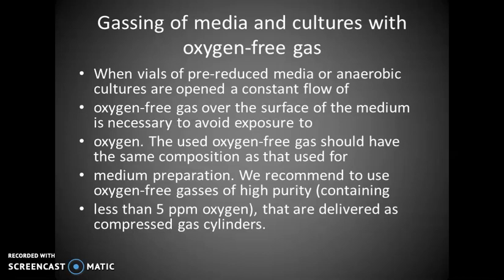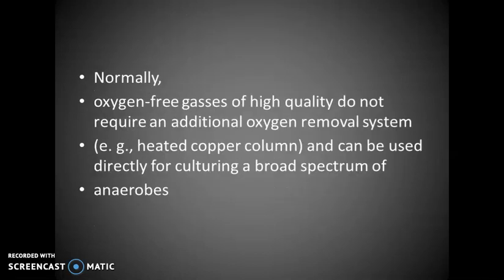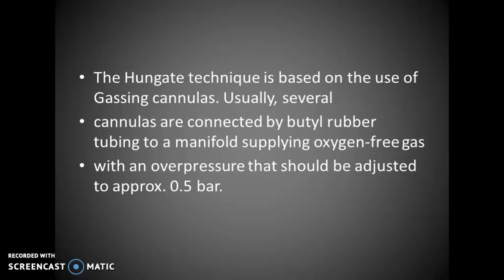The oxygen-free gas used should have the same composition as that used for media preparation. So it is recommended to use oxygen-free gases of high purity. Normally, these oxygen-free gases of high quality do not require an additional oxygen removal system, so they can be used directly for culturing a broad spectrum of anaerobes.